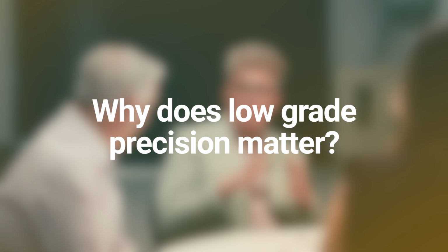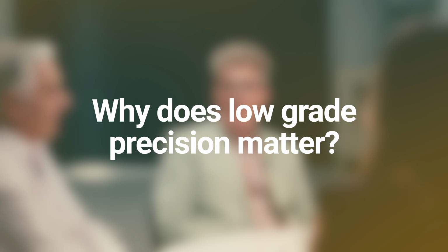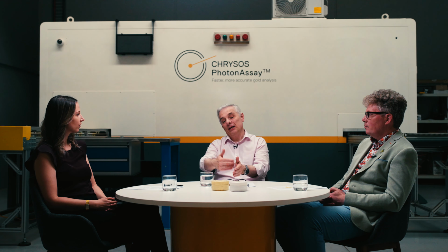And why does precision at the cutoff grade matter? How does that affect things? We make the decision based on a block, but where we might make a decision based on a sample is actually earlier in the process, when we're trying to draw our wireframes. We can get situations where it's all grey rock, but somewhere in there it goes from very, very low grade to something that's mineable back into low grade, and we might struggle with geological criteria and need to fit that wireframe based on a grade value.